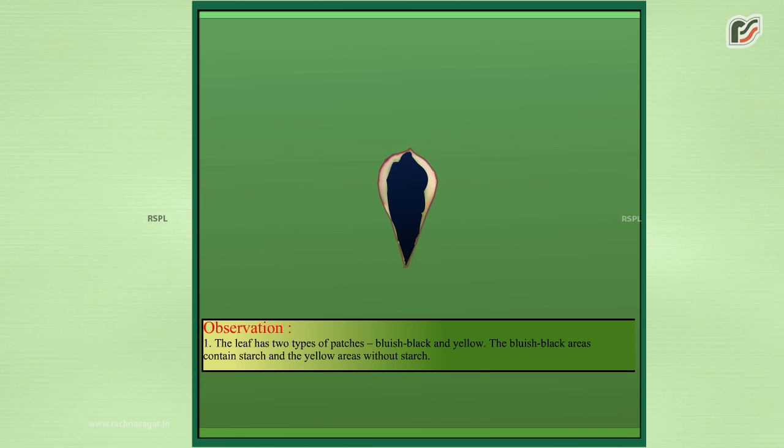Observation: The leaf has two types of patches - bluish black and yellow. The bluish black areas contain starch and the yellow areas without starch.